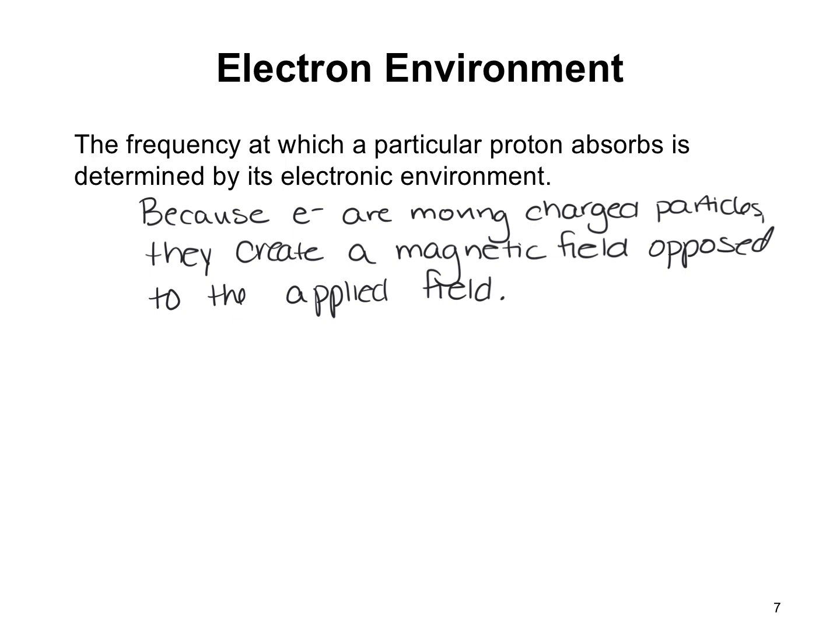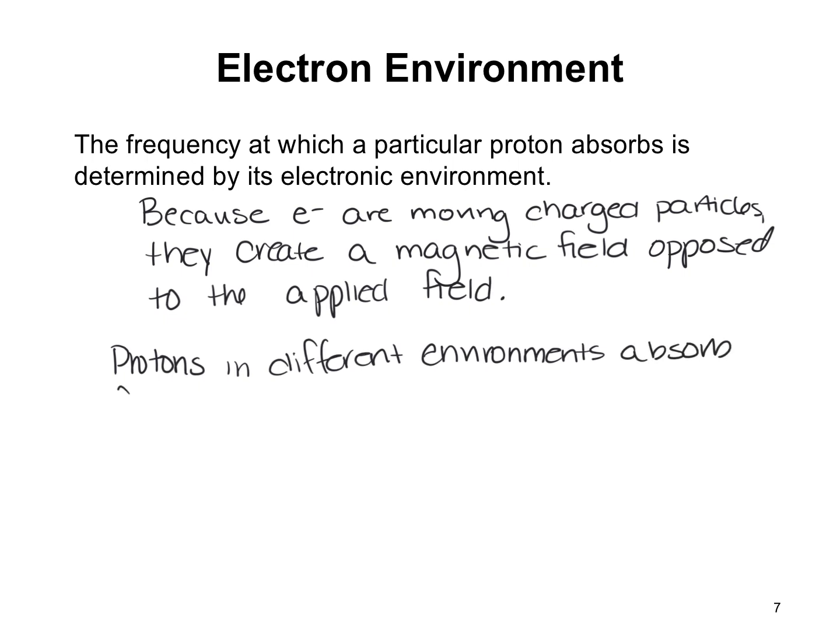So that means that protons in different environments absorb slightly different frequencies. And because they absorb slightly different frequencies, we can see them in the NMR.